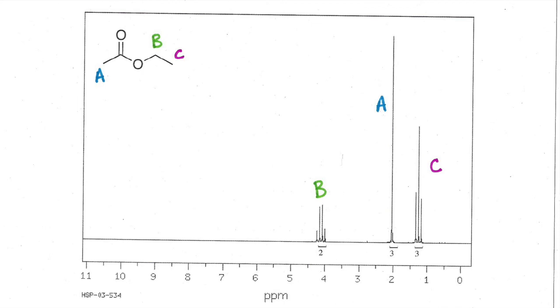The spectrum for this molecule provides a lot of really good information to help with understanding your structural analysis. We have good representation for protons alpha to a carbonyl. We have good representation for protons that are bonded to a carbon that's bonded to an electronegative atom. We see multiplicities of singlets, triplets, and quartets. And so there's a lot of really good information, a lot of really good reminders in this spectrum.